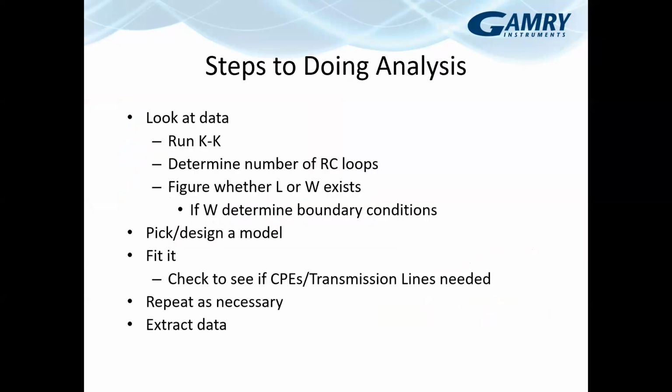So when you're doing analysis, the first thing to do with EIS is to look at the data. As you run more and more of these, especially if you're running similar types of systems, there should be an expectation of what the data is going to look like. And if it's starting to deviate from that, then that is a problem. If you're not sure, or if this is your first time running EIS and you don't know whether this is what your data is supposed to look like, you can always run a KK transform, and that's a good first step if you don't know.